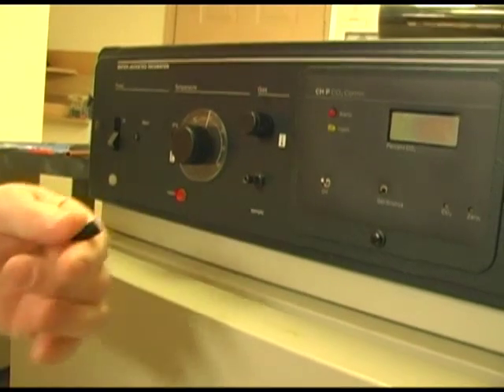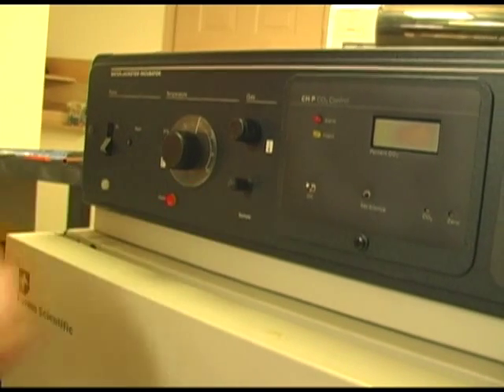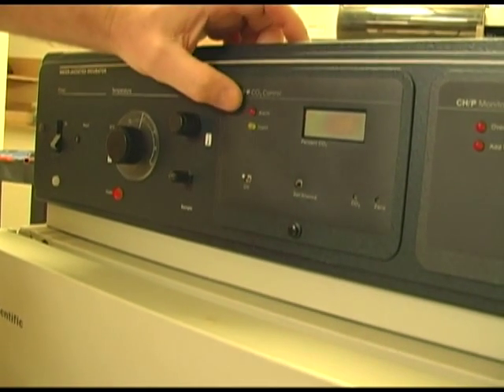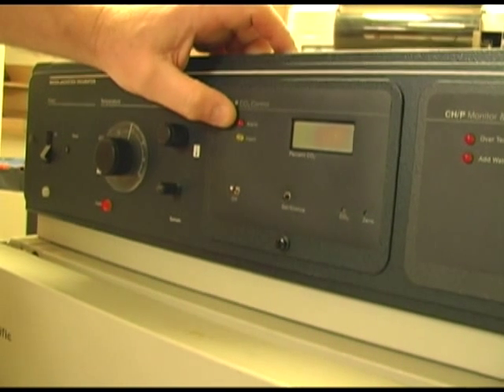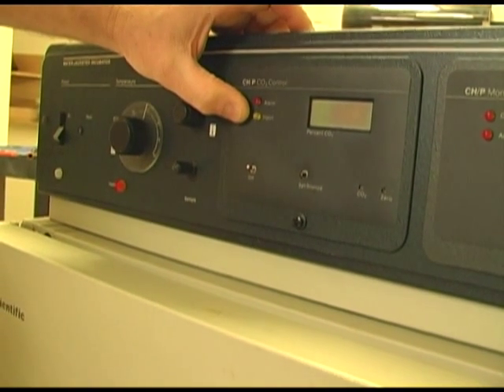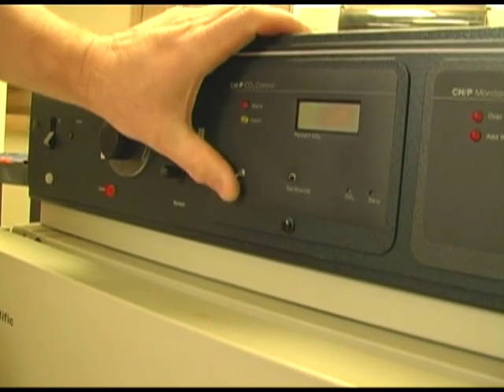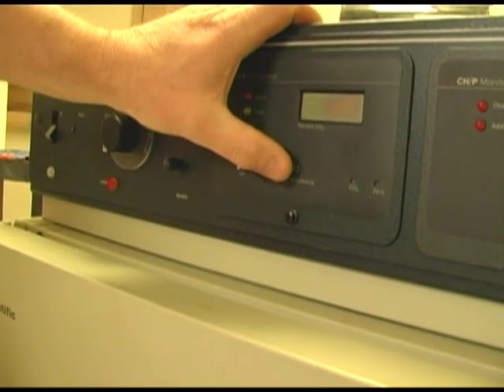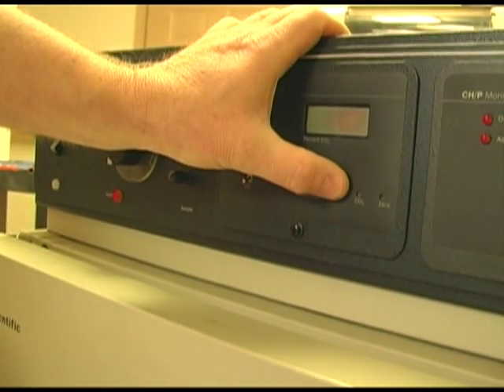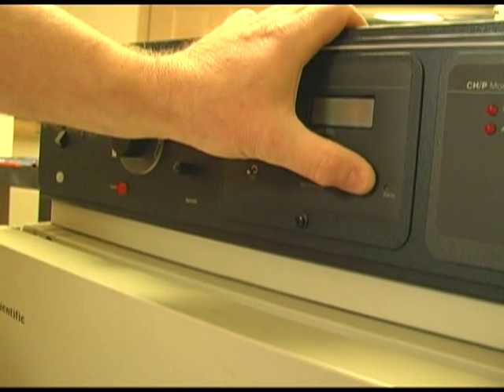Right here you have a sample port that goes directly into the chamber so that you can use a Fyrite to see what percentage of CO2 is in your incubator. This is the CO2 control. You have an alarm — that's if your CO2 gets too high. You have an inject LED; when lit, that tells you the instrument is calling for CO2. You have an on/off switch and a set/silence button. By pushing it you can silence an alarm; by pushing and holding it you can change the CO2 set point. There's a small pot to change and set your CO2 set point, and also a spot to zero it.